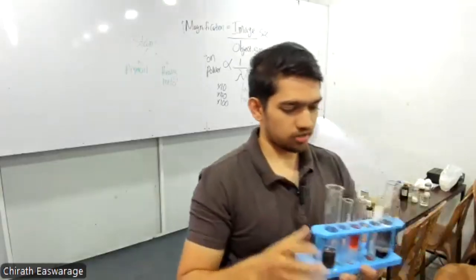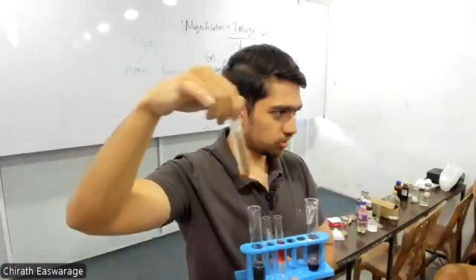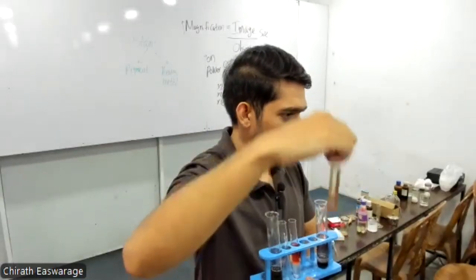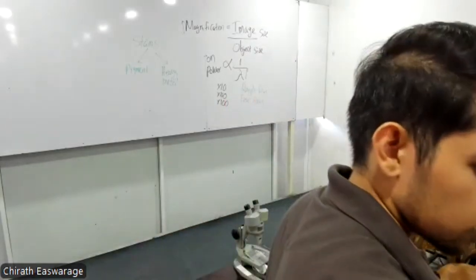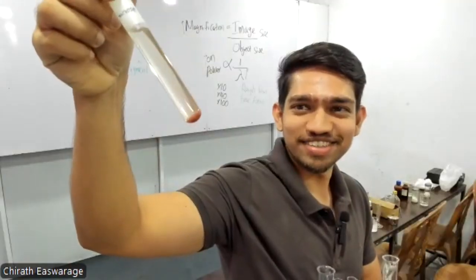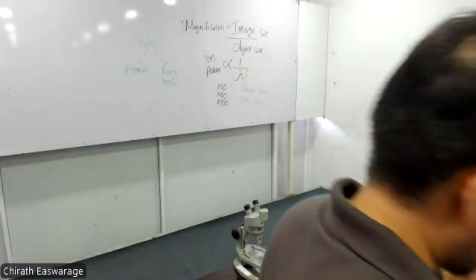Second one, what did we do? Non-reducing sugar, sucrose. What was the process? We added an acid, we heated, then we neutralized it. Then we did the Benedict test. Can you see? Online people, can you see? The brick red precipitate underneath. Right. Next, what did we do?